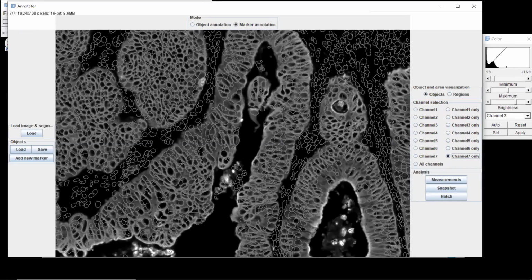So here it's important to be able to look at these different regions: the nucleus, the nuclear membrane, and the cytoplasm. Ideally, you would have a marker for the membrane and a marker for the cytoplasm, and it would be very helpful to segment the nuclei as well. But when you do that, your panel is not as large. And so generally people don't use these markers because they want to have more information about the kind of cells they have. But we can somehow do it computationally.